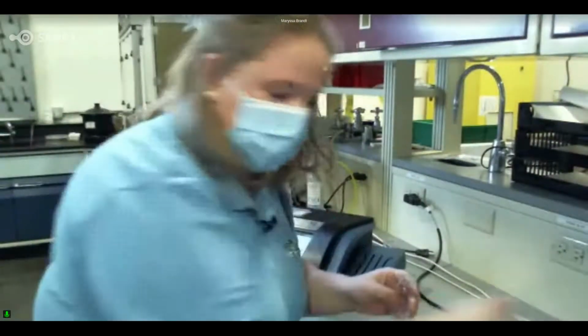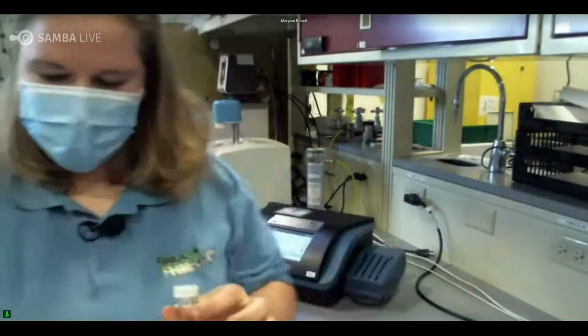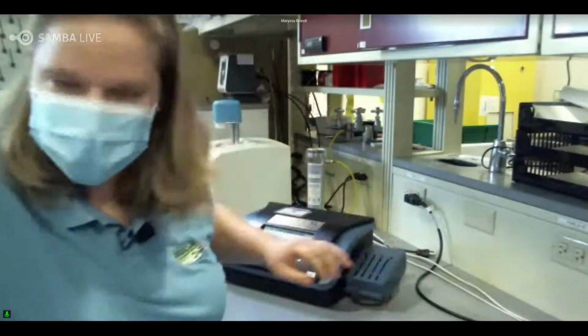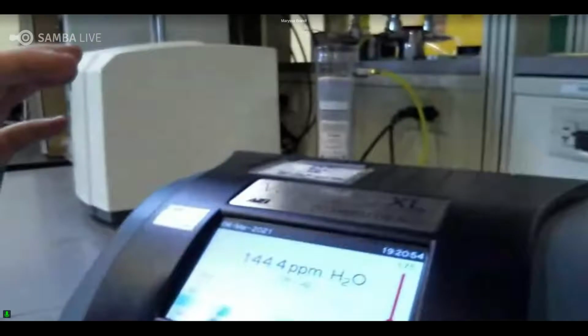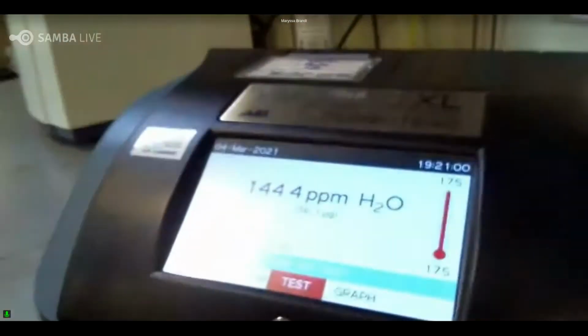And then we're going to grab our cap with our septum on it. We're just going to put it on. And now this is ready to go in the Vapor Pro. So I'm going to set this right here for now, and then I'll come and show you how we set it up on our program. You're able to see that. Apologize for the blur.